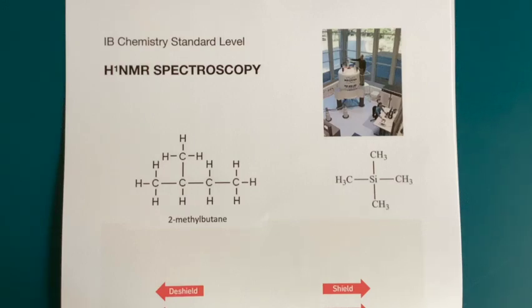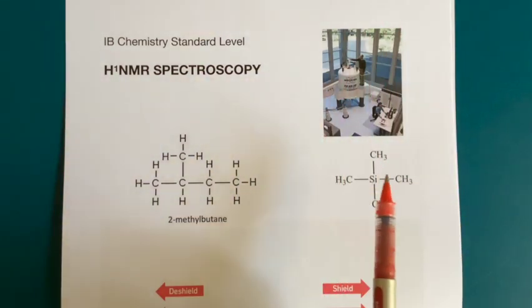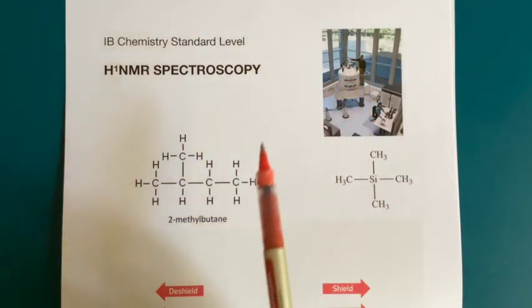Hello and welcome. Today I want to speak to you about some basics of hydrogen 1, H1 NMR spectroscopy, specifically with reference to the kinds of questions that students would have to solve on IB chemistry standard level exams. So here we see an image of an NMR spectrum machine, which is quite a complicated device.